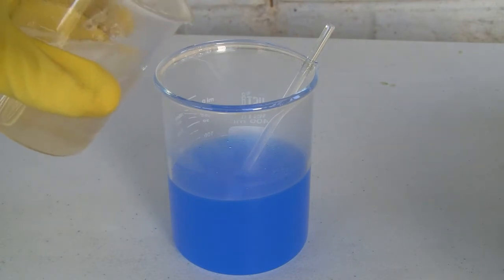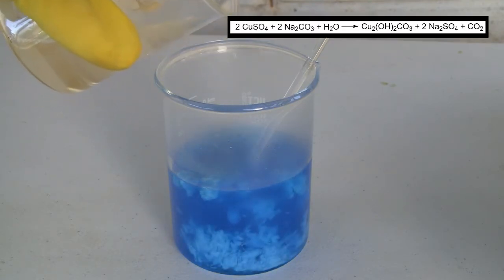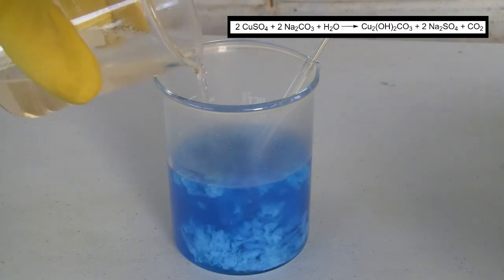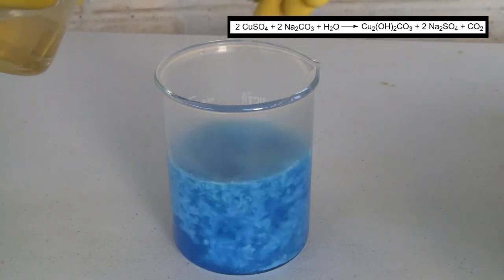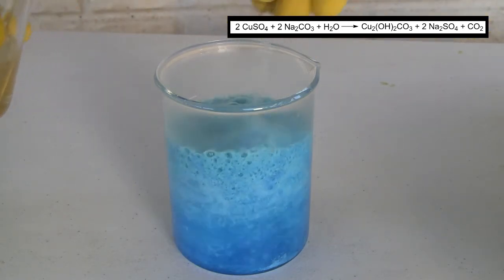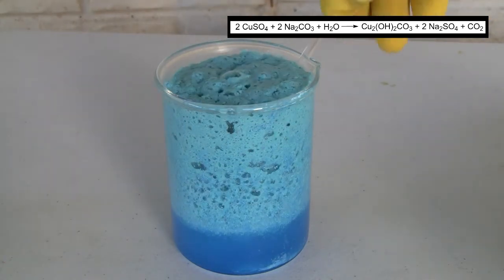Once dissolved, the copper sulfate solution is removed from heat and the sodium carbonate solution is added in small portions. The following reaction takes place when the sodium carbonate solution is added to the copper sulfate solution. The basic copper carbonate precipitates out as a greenish-blue solid while the sodium sulfate stays in solution and carbon dioxide is released as a gas.